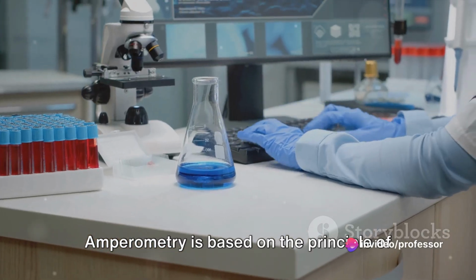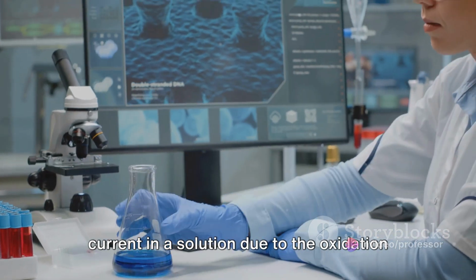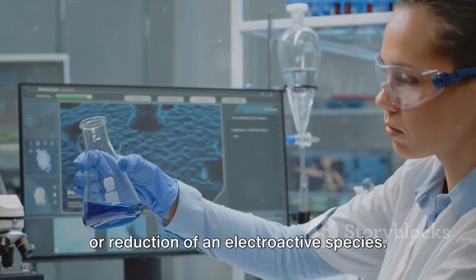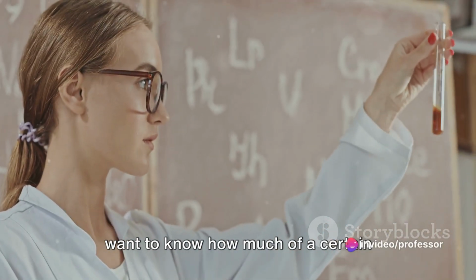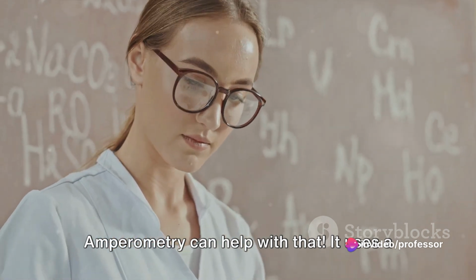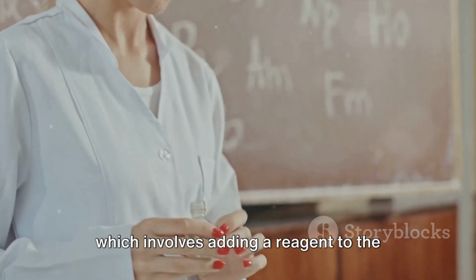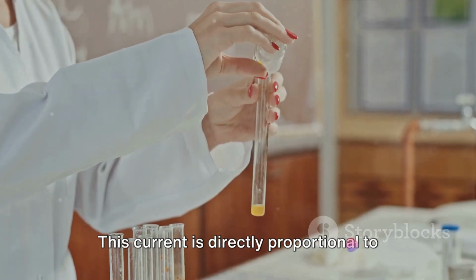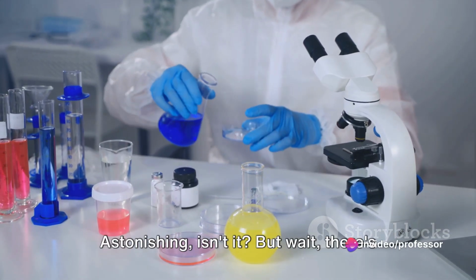Amperometry is based on the principle of electrochemistry, where it measures the current in a solution due to the oxidation or reduction of an electroactive species. Picture this: you have a solution, and you want to know how much of a certain substance is present. Amperometry can help with that. It uses a process called Amperometric Titration, which involves adding a reagent to the solution and measuring the current that's generated. This current is directly proportional to the amount of substance in the solution.